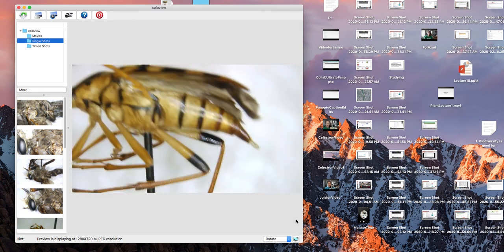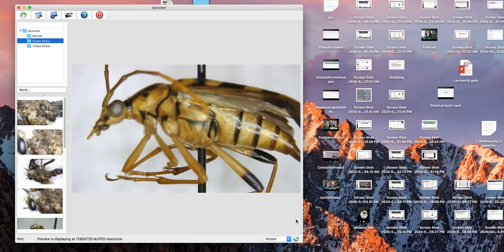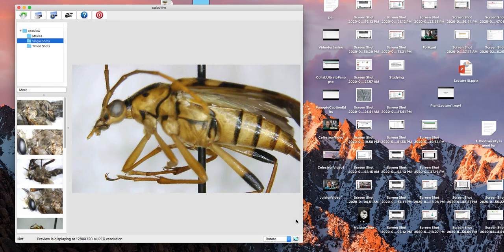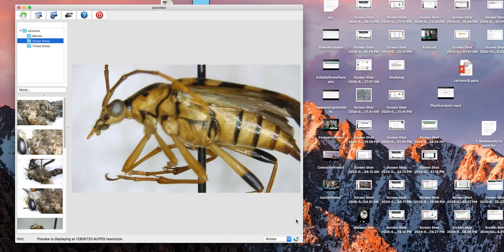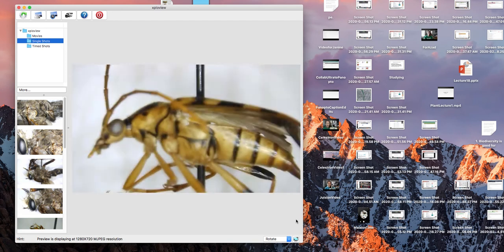What I've noticed with many of these microscope models is that they tend to have this plastic ring to keep you from accidentally bumping up against the lights or the lens itself. Unfortunately, that plastic ring might get in the way or interact with whatever you're holding your insect to. In this case, I have a bit of clay that's sticking to the stage in the paper, and it's very easy for that clay to run into the actual plastic ring. So you have to be careful about that.